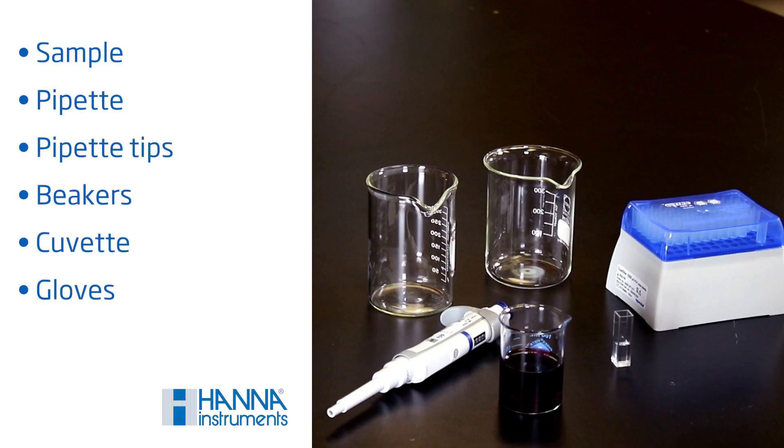You'll need your sample, a pipette, your pipette tips, beakers, a cuvette, and gloves. You always want to wear gloves as to not contaminate the pipette tip, cuvette, or sample. You'll also want to organize your workspace for a smooth workflow when pipetting. This will help you to maintain fluidity and streamline the process.